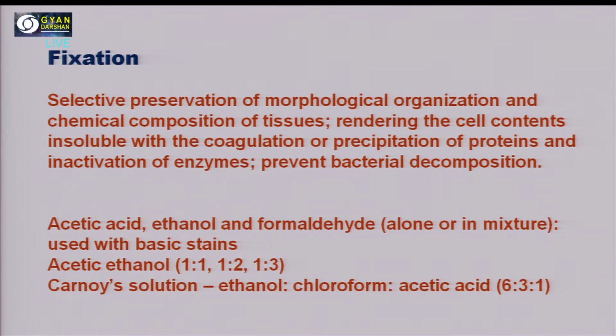So these are the three main purposes of undergoing the fixation process. Here you can use reagents like acetic acid, ethanol and formaldehyde mixture, alone or in mixture. Acetic ethanol, you can use in 1:1, 1:2 or 1:3 ratio. Carnoy's solution: ethanol, chloroform, acetic acid in a 6:3:1 ratio. So you can use any of these agents, or any of the combinations, to undergo the fixation process.